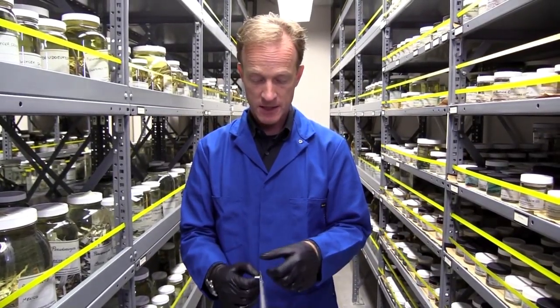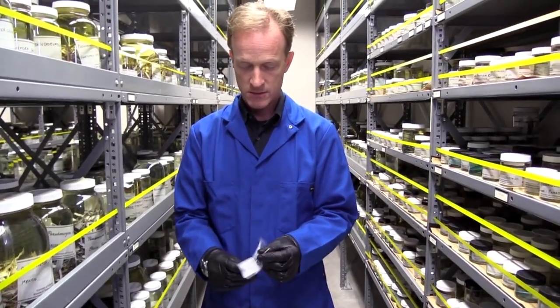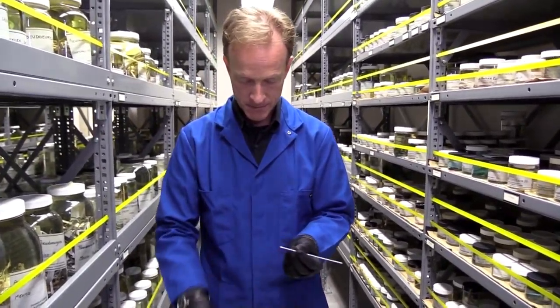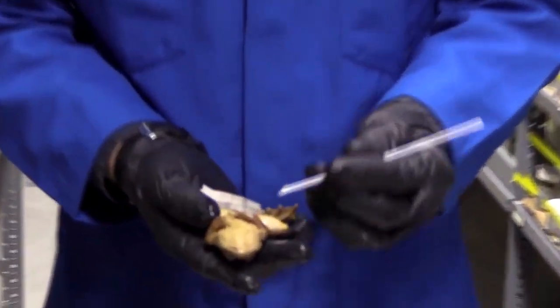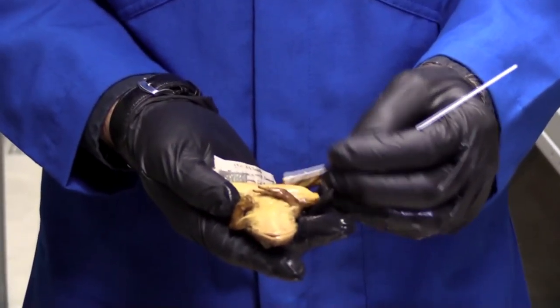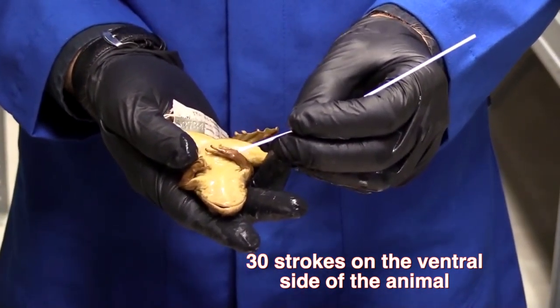Now I'm ready to collect the skin swab. Here's my swab — I open up the package, pull out my swab, and bring my frog back up. Just as with other specimens, we're going to swab the ventral side of the animal, not the dorsal side, and we're going to do about 30 strokes.